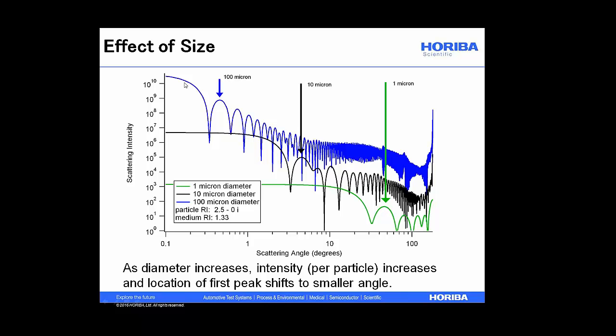Incidentally, when I use Mie scattering and I look at scatter intensity as a function of scattering angle, I see exactly the same trends that I saw with Fraunhofer. Large particles, small angles, and strong scattered intensity. I am also allowed to extend the calculation all the way out to 180 degrees scattering angle and down to quite small. Well, I'd extend it to 1 micron particles. Here a fellow would get silly to keep going, but you can keep going as long as you want.